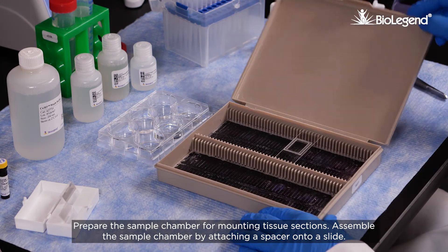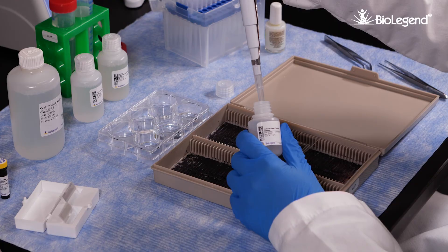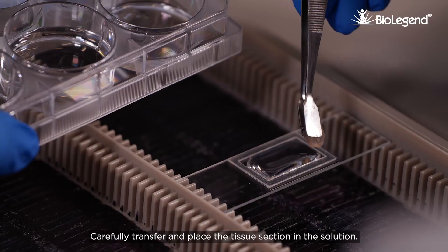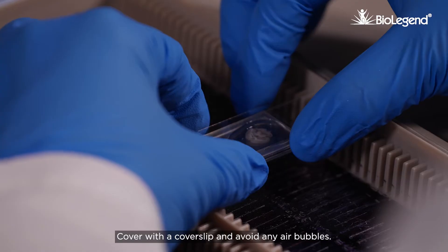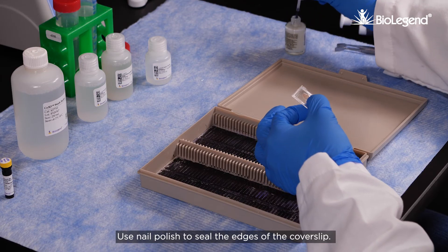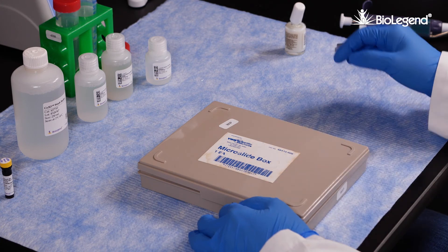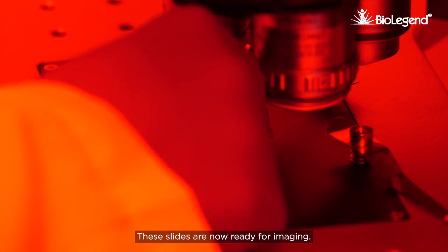Prepare the sample chamber for mounting tissue sections. Assemble the sample chamber by attaching a spacer onto a slide. Fill the space with C3D tissue clearing solution. Carefully transfer and place the tissue section in the solution. Cover with a cover slip and avoid any air bubbles. Use nail polish to seal the edges of the cover slip. Let the slides air dry for two hours. These slides are now ready for imaging.